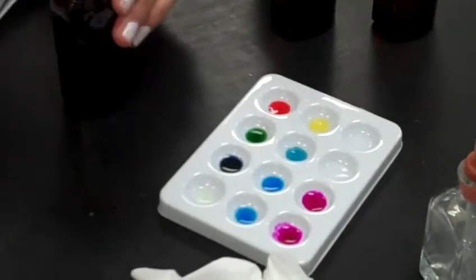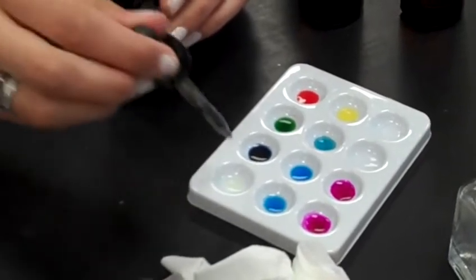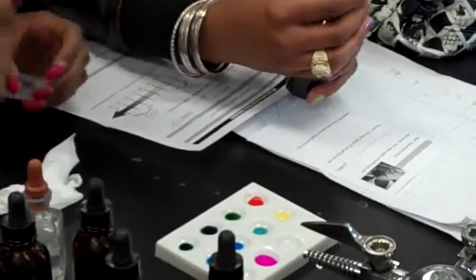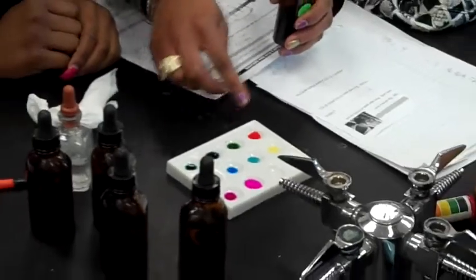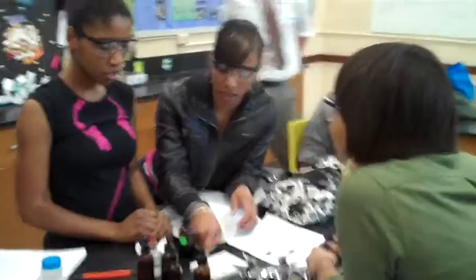The second two are the same color, so it'll be sodium hydroxide. It's going to be green. Oh no, it's not. Yes, it's sodium hydroxide. Oh, it smells so good. You can smell it? Yep. Which one do you use? So it's purple. That was hot. That's probably going to be pink. It better be. Yeah, it's a base. How do you know? Because look at how these colors match. They don't match none of these. No, I mean, how do you know it's a base? What if it's an acid? Because the base is in this spot.